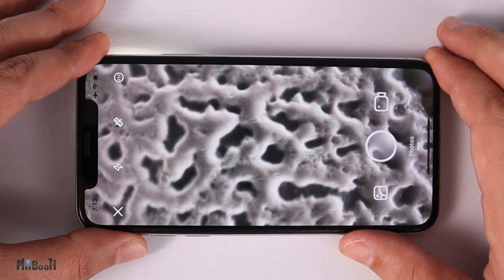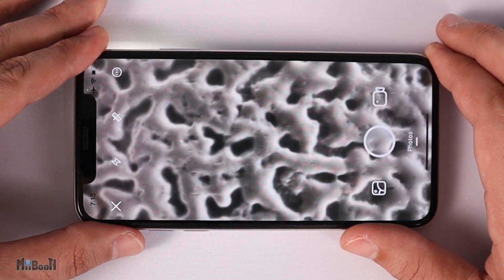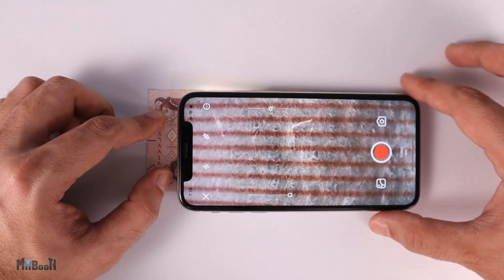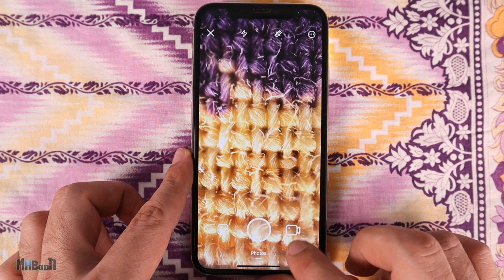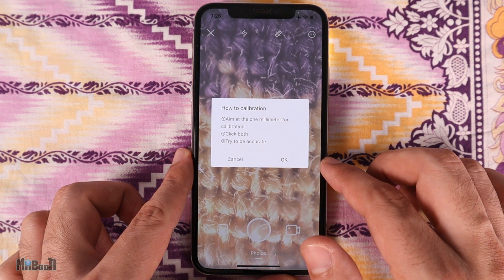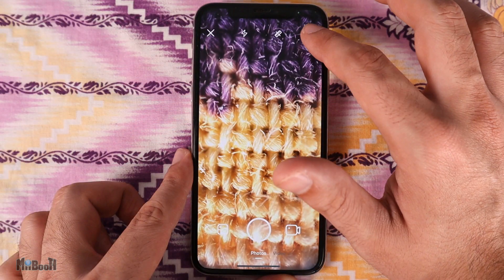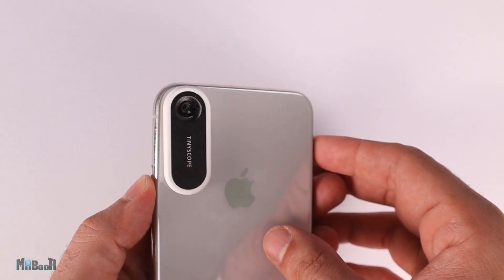Place the phone flat down on the desk and you can see the texture of the table with clear detail, well-magnified and well-illuminated. Next up is a currency note — place it flat on top and watch. Here is a piece of fabric. You can enjoy the view or take pictures and videos from within the app. There's also a ruler option for measuring micro objects, which requires calibration, and you can toggle the flash and adjust resolution from settings.